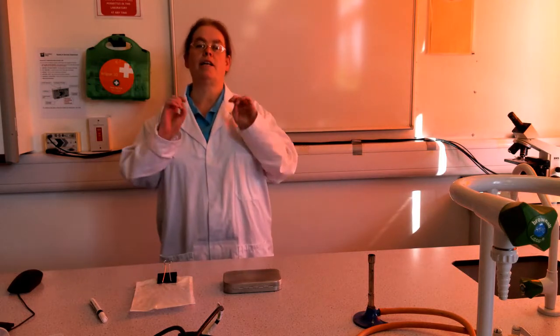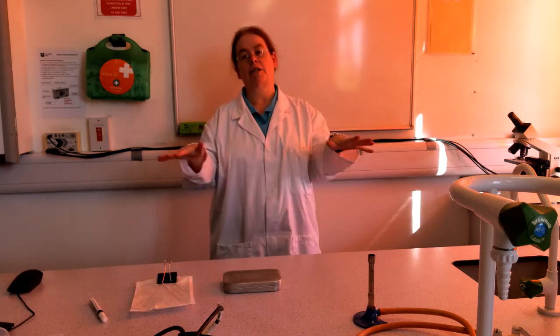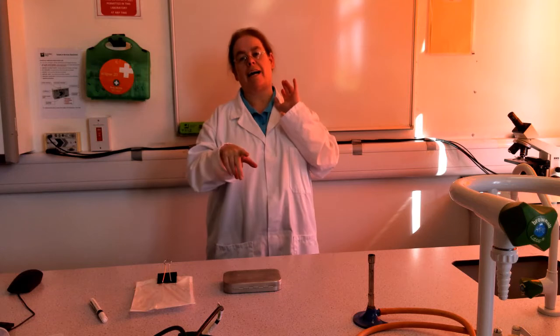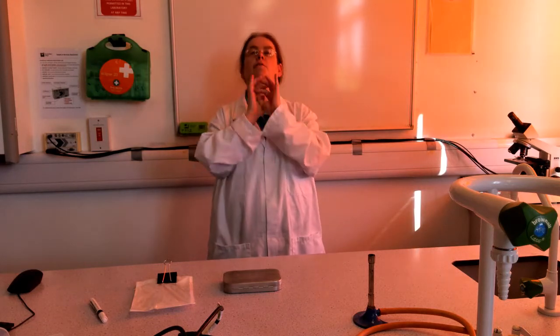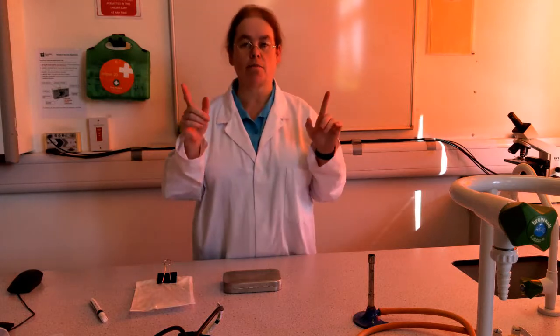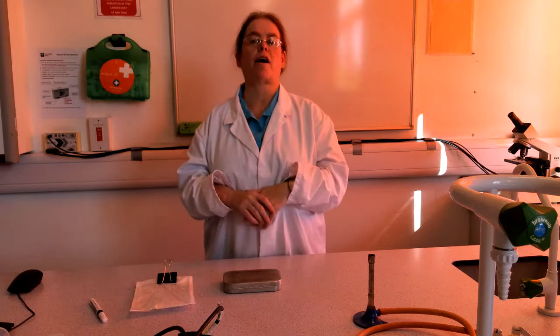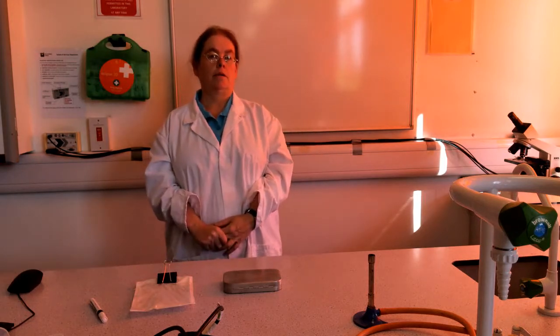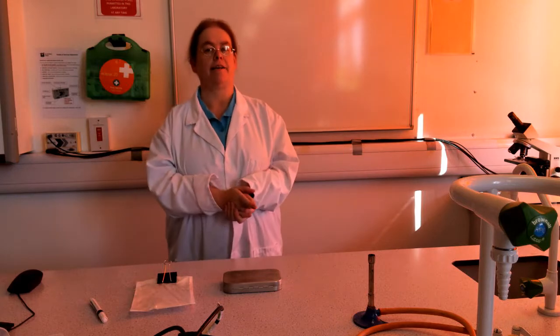It's the one where we dilute the culture 1,000,000 times, so we've just got few bacteria, spread it on a plate, leave it, come back, and one bacterium has become a big blob, which isn't a science word, so we'll call it a colony, and you count the colonies. You know, 1, 2, 3, 4, 5 colonies. Well, that means there were 5 bacteria. I diluted it 1,000,000 times, so before I diluted it, there were 5 million bacteria. Great.